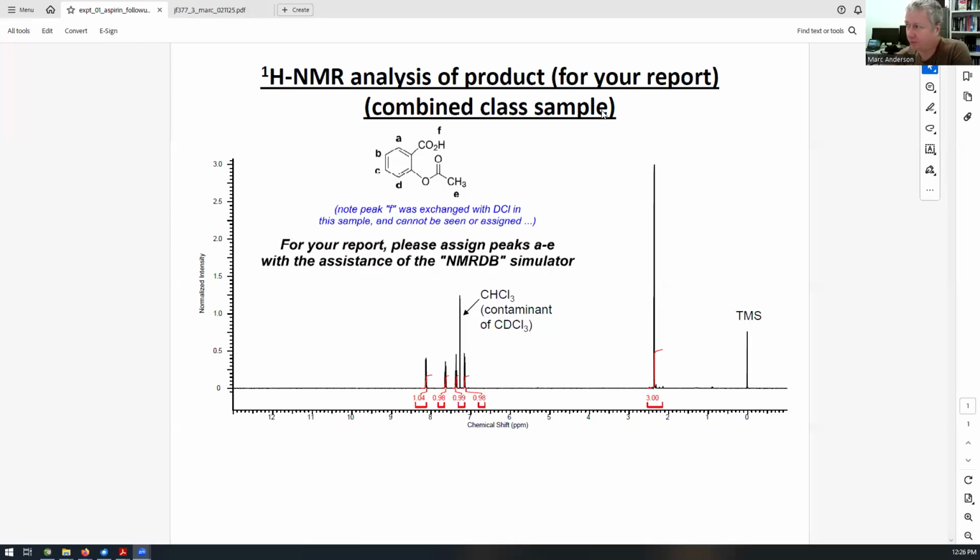This is an example of something you might have to do in the organic lab. This is the aspirin synthesis and an example of the NMR spectrum and how we know the chemical structure, and we label the signals A, B, C, D, E, F. But then you have these signals down here that are part of the NMR spectrum for aspirin, and we're trying to figure out which peaks correspond to which letters. I'll show a zoom in a second just to discuss the basic spectrum.